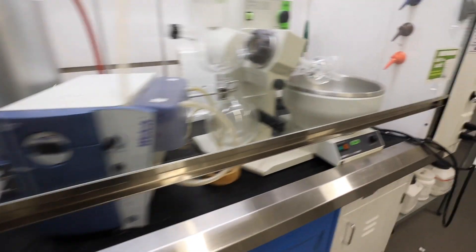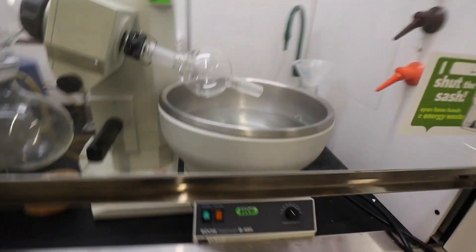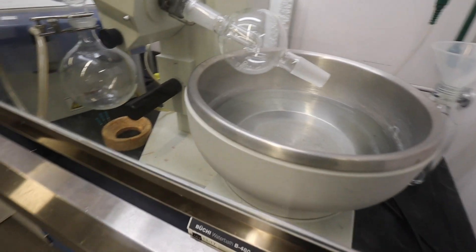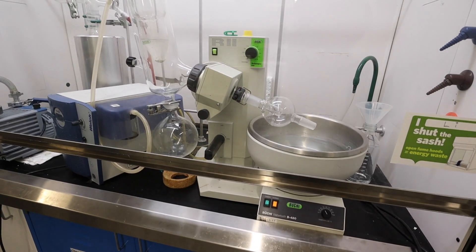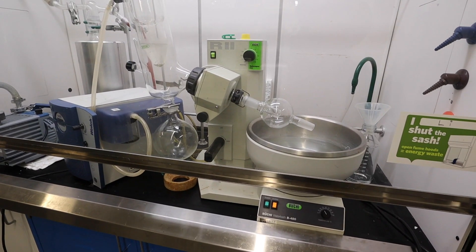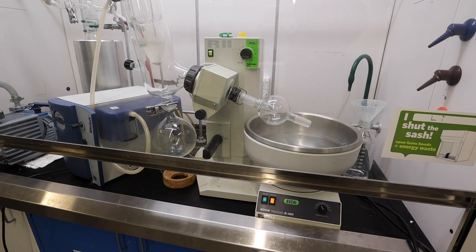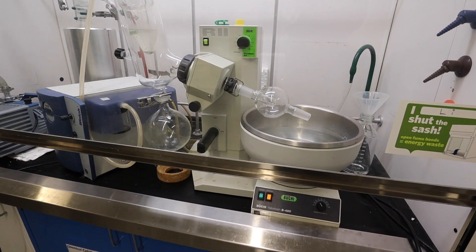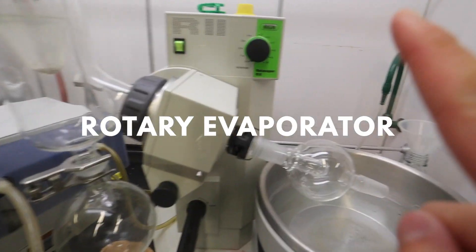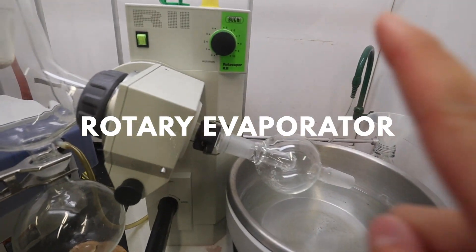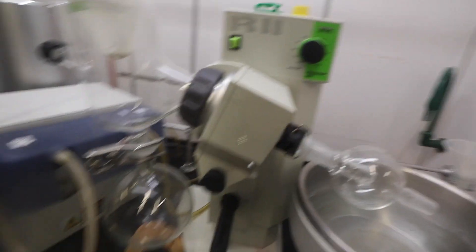The first piece of equipment that I want to share with you is this instrument here. This is the rotovap or the rotary evaporator. Oh my gosh, you need to look that up. We just call it the rotovap.